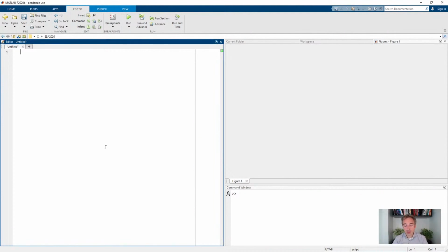So first of all, let's cover two important use cases that we have not been able to cover so far. The first use case is you want to couple several spin system parameters together. For example, you have two nuclei and you want to lock those two hyperfine couplings together in a fixed ratio. For example, you might know these values or this ratio from previous experiments or from density functional theory calculations. Another use case is if you want to fit experimental parameters, such as the temperature, the microwave phase, or field shift. We're going to look at these two use cases in turn.